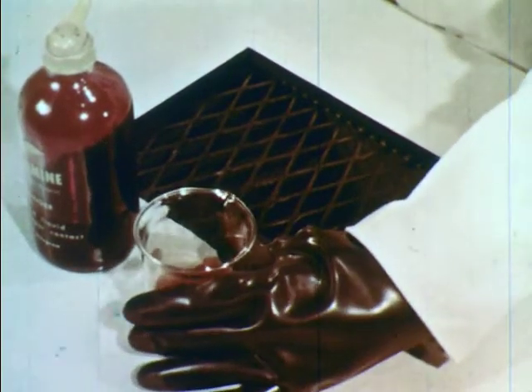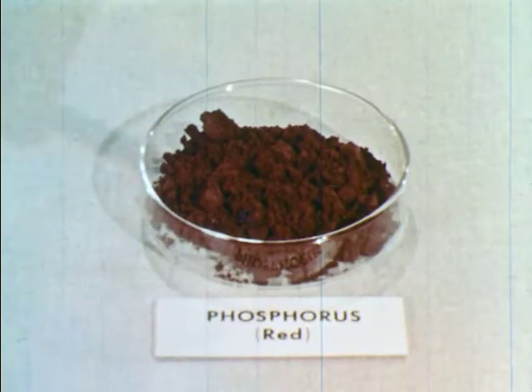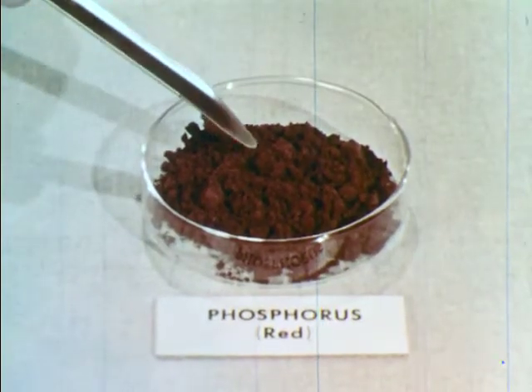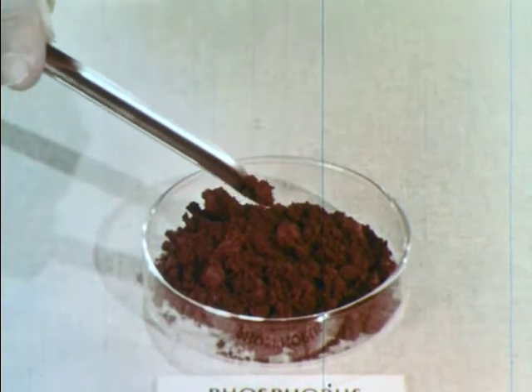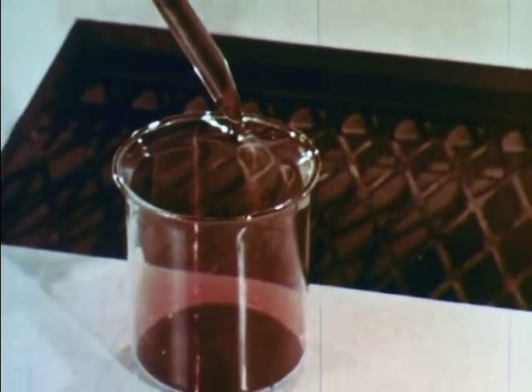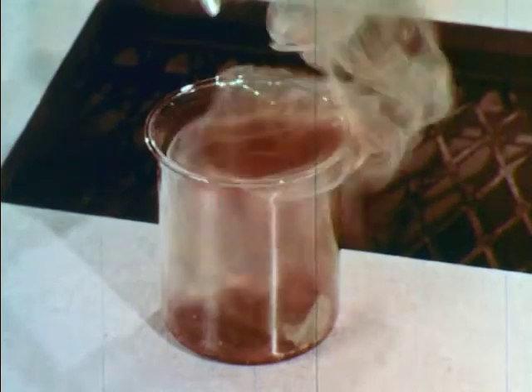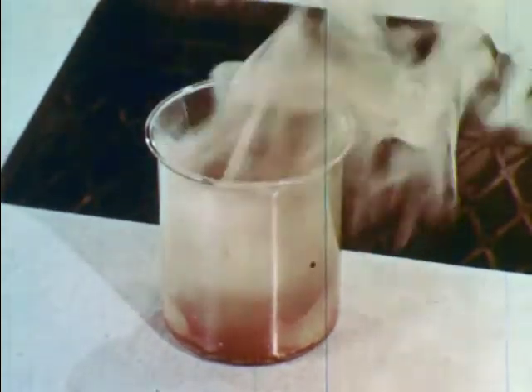How does bromine react with some common elements? First, let's try the non-metallic element phosphorus. A reaction takes place. The product is phosphorus tribromide, which fumes at the reaction temperature.